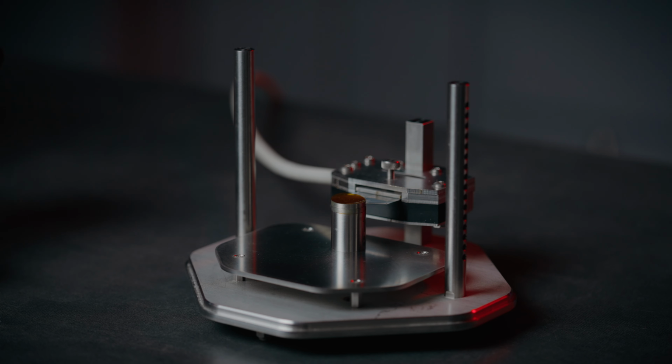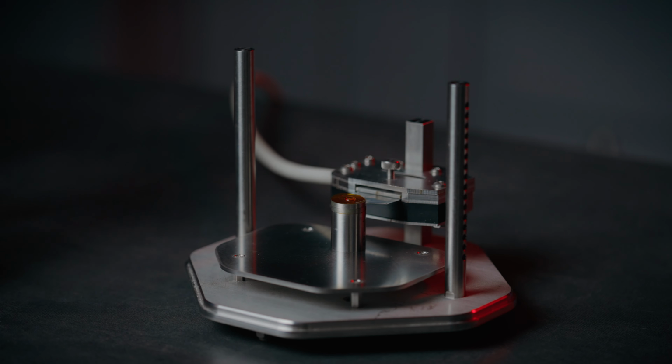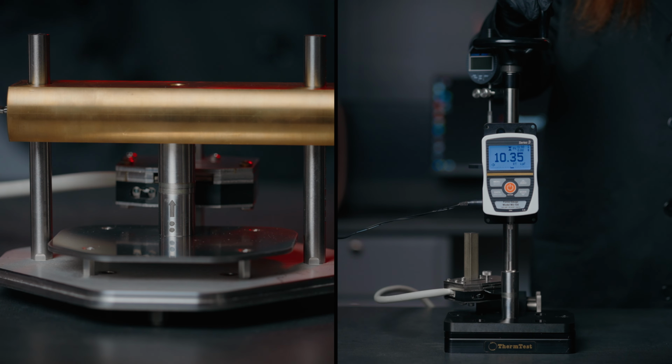In some cases, contact agents like ethylene glycol can help reduce contact resistance by filling microscopic air gaps between the layers without significantly altering heat flow behavior. And usually a single drop is all you need. Consistent and adequate pressure is also essential. It helps ensure uniform contact across the full surface and reduces variability between measurements. The best way to achieve this is by using thin film specific setups, like rigid backing materials and a controlled applied weight designed to keep pressure stable and repeatable.